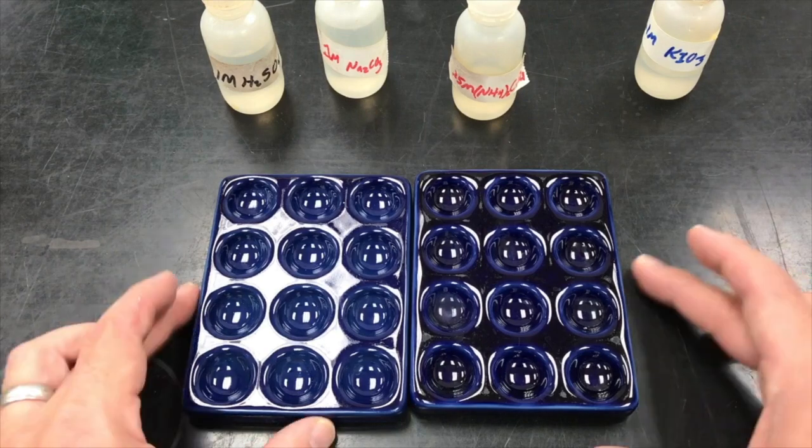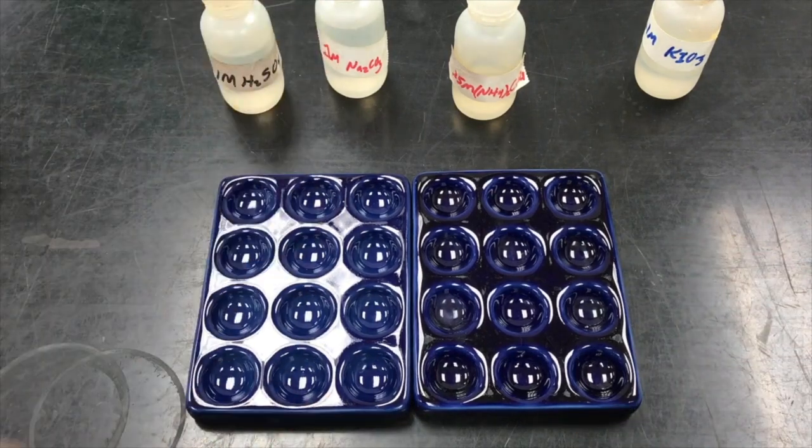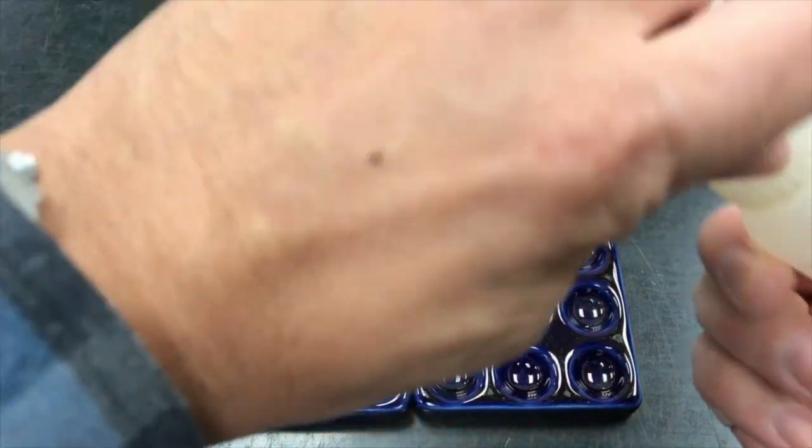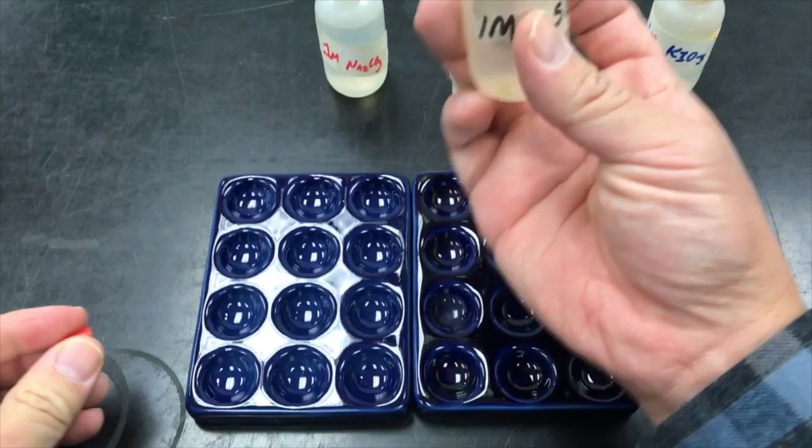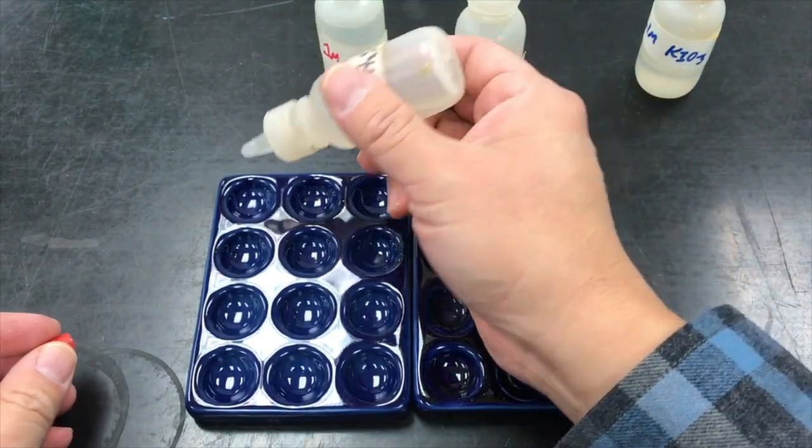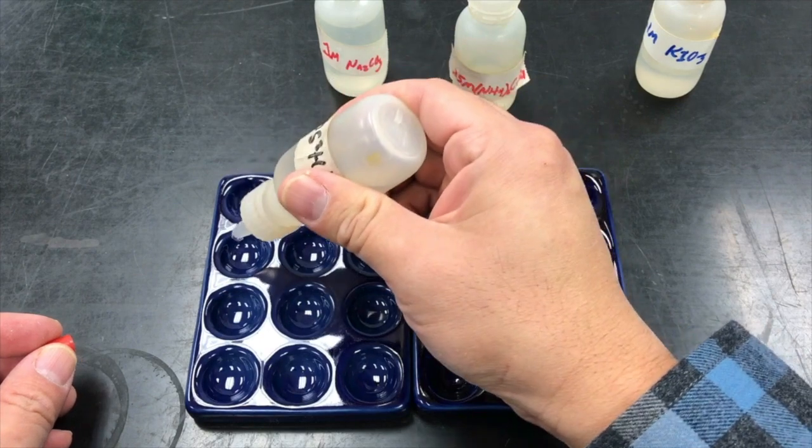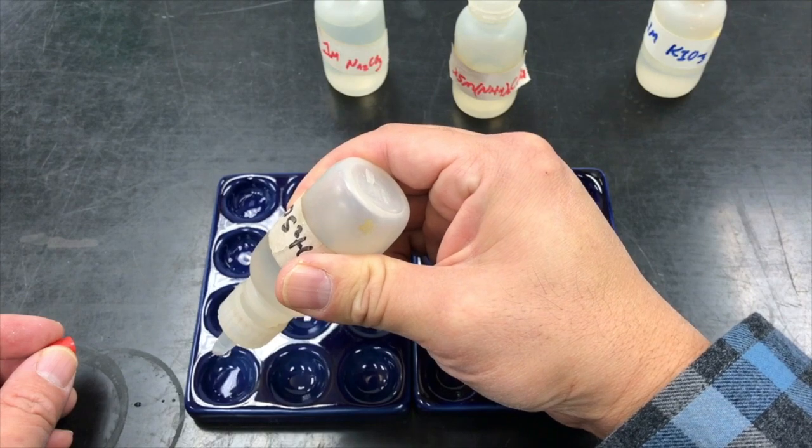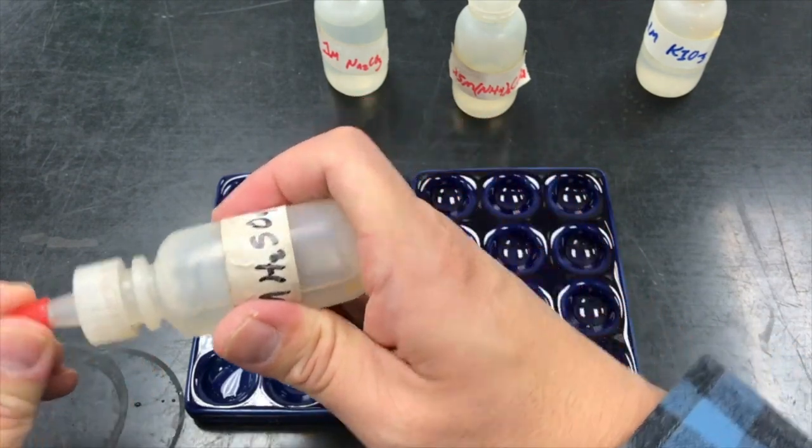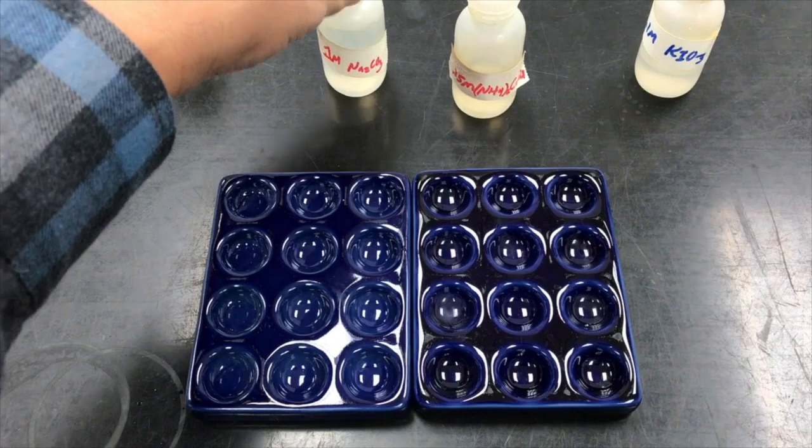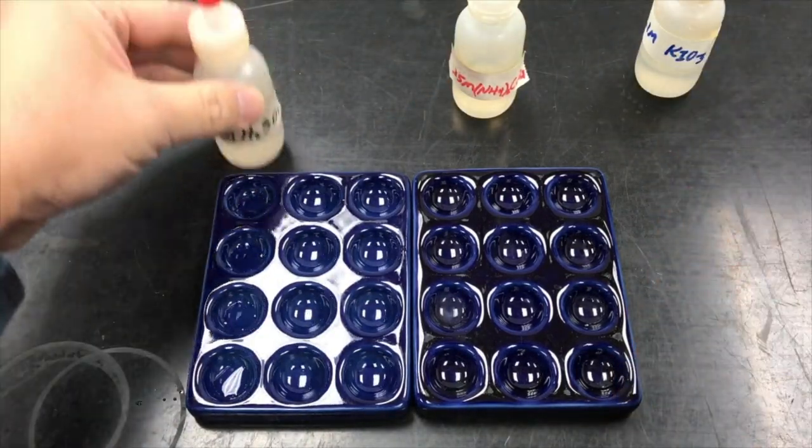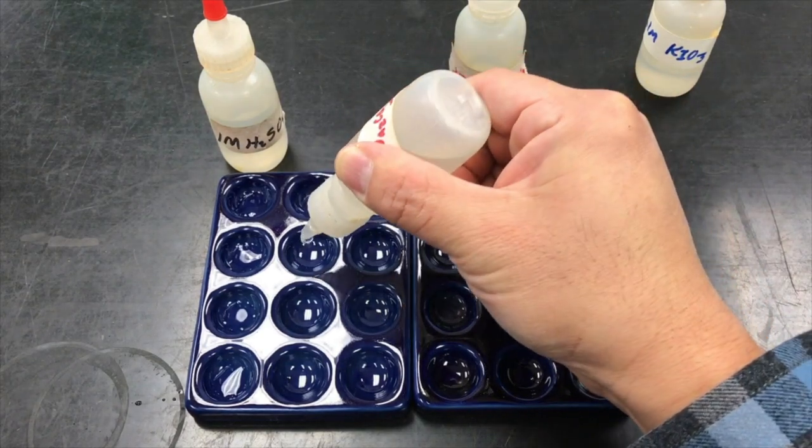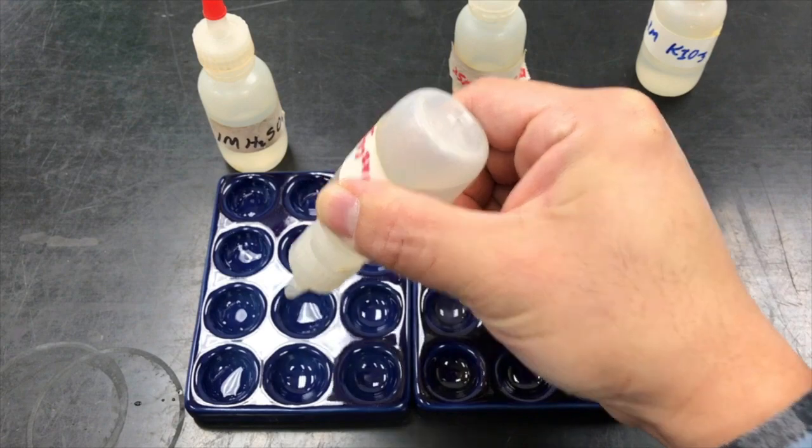I'm using these wells here, and we're just going to react them in a grid-like pattern. All we need to do is take a couple drops. So I'm going to start with the sulfuric acid and just down the row put three drops in each well. I'm just going to follow suit with each of these others.